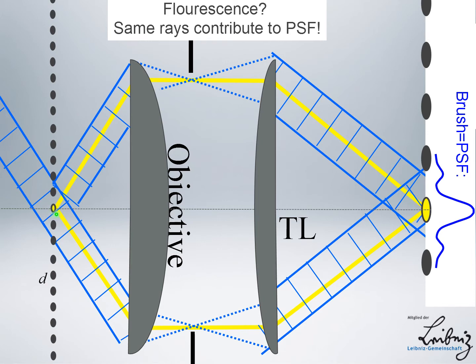And the interesting bit is, if you think about what is the finest possible contribution that rays or plane waves can make, then you find that it is actually the same two rays. In the original Abbe picture, the undiffracted zero order would just about go onto one side of the objective, make it through the aperture, and contribute to the interference with the first order, and here only the plus first order, that would make it through just about the other side of the objective and interfere with the zero order.